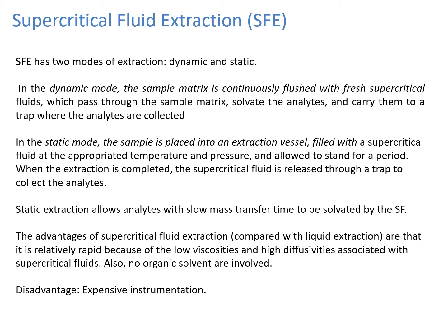So the advantage of this extraction compared to liquid extraction is that it's relatively rapid because of the low viscosity and high diffusivities associated with supercritical fluids, and also no organic solvents are involved in this extraction mode. The disadvantage of this mode is the expensive instrument. So that's why in most places, it is very difficult to get this kind of extraction. Basically, the engineering department will use supercritical fluid extraction for their applications.